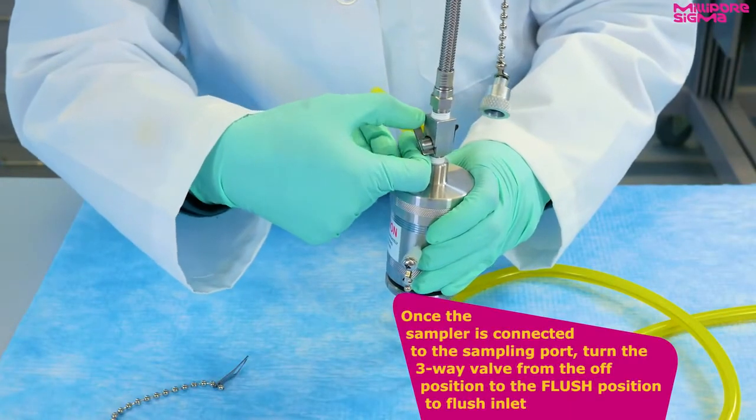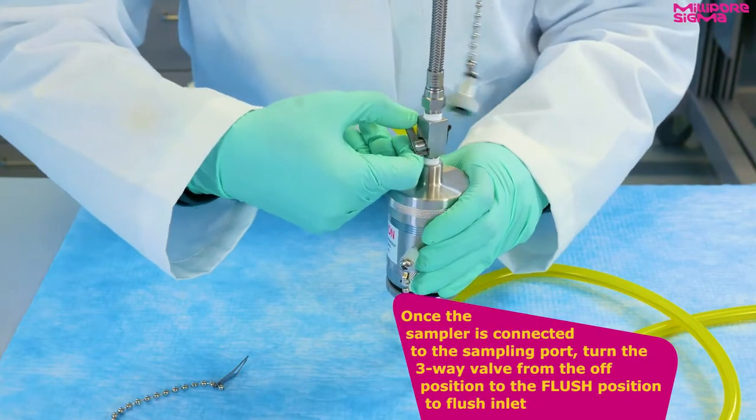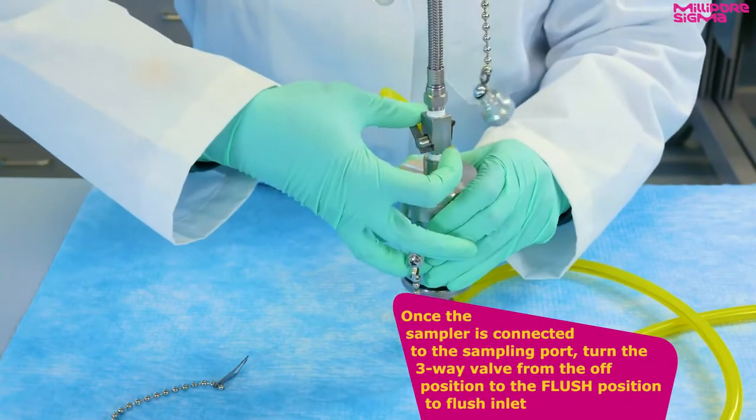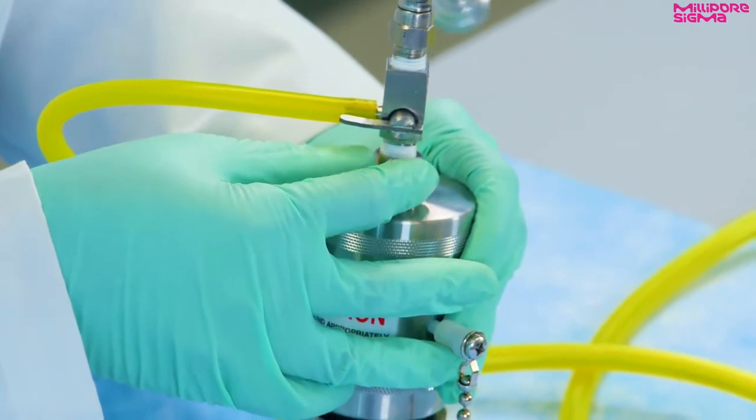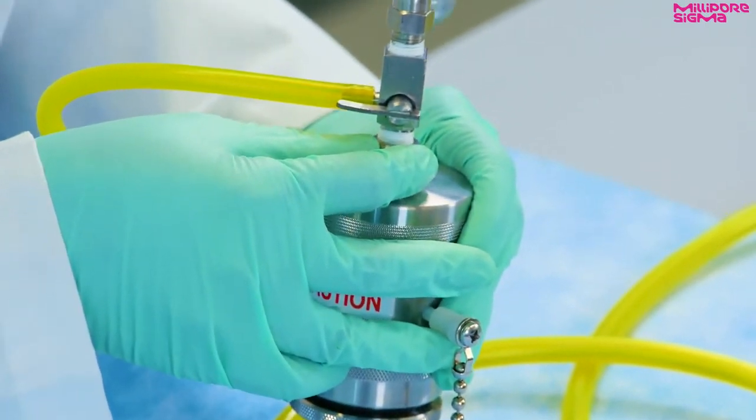Once the sampler is connected to the sampling port, turn the three-way valve from the off position to the flush position to flush the inlet hose. Allow a sufficient quantity of fluid to flow through the bypass tubing to flush contaminants.